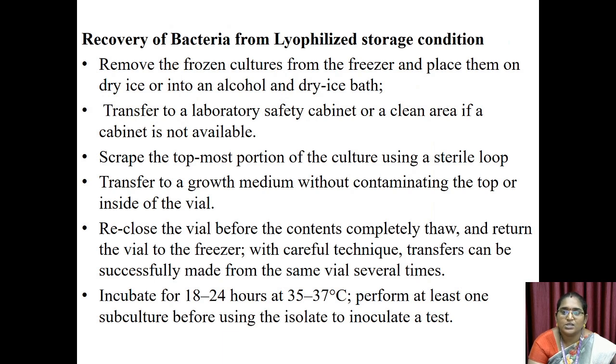Remove the frozen cultures from the freezer and place them on dry ice or into an alcohol and dry ice bath. Transfer to a laboratory safety cabinet or a clean area if a cabinet is not available. Scrape the topmost portion of the culture using a sterile loop. Transfer to a growth medium without contaminating the top or inside of the vial. Reclose the vial before the contents completely thaw and return the vial to the freezer.